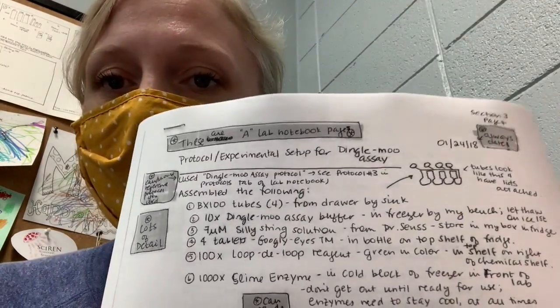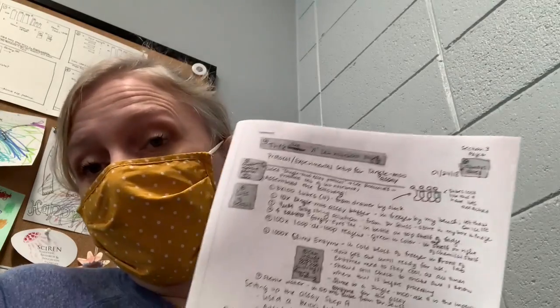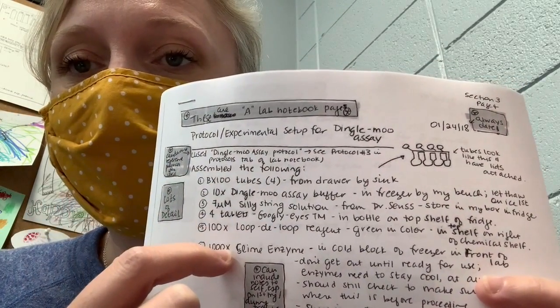So the first thing we're going to cover is lab notebooks. I've made a little tutorial where I totally made stuff up, this dingle moo assay. It's not real. But I can give you one of these copies if you'd like to see what I think are good examples of lab notebooks. So I can show you this, but there's lots of detail.